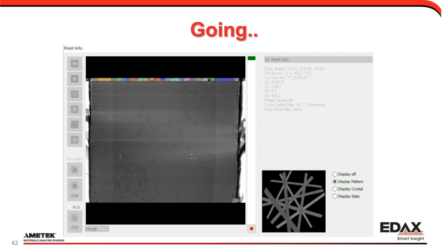And again, it's just useful, especially if your signal changes. I find it really useful for tungsten-based scopes. Again, if some of my beam conditions change, I can usually see it in the IQ too. But in this case, it's green. Good. Yellow starts to mean meh. Red means I should probably look at why it's red.